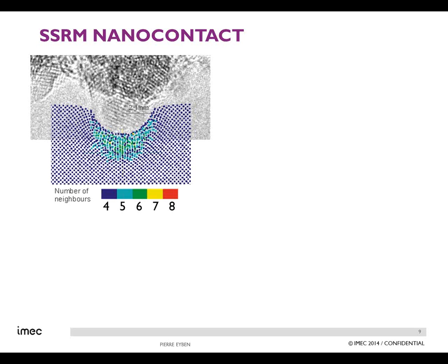This is basically the image that you see here. This is a zoomed view of the TEM apex of the tip. And you see that this grain here, the one that will make contact, has a radius of 2 nanometers, a diameter of about 4 nanometers. And what we have done together with some colleagues from the University of Sydney was to make molecular dynamics simulations of the transformation of the diamond cubic silicon that we have in its normal phase, which is also called silicon 1, the relaxed silicon.